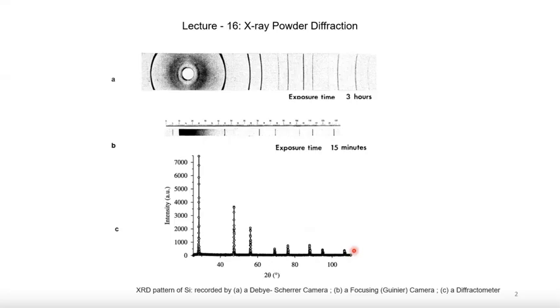It is very important that when we analyze X-ray powder diffraction data, the data should be of high quality, and that depends on how your samples are prepared. In many cases, we see that the samples are not properly prepared, and therefore crystalline size, etc., are not uniform. Therefore, we do not get proper quality data. We will talk about quality data later.